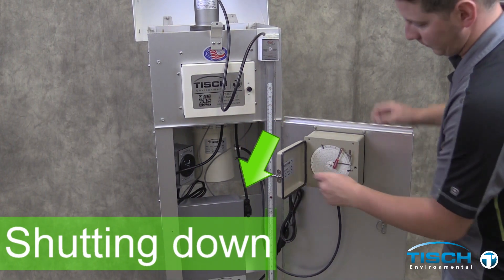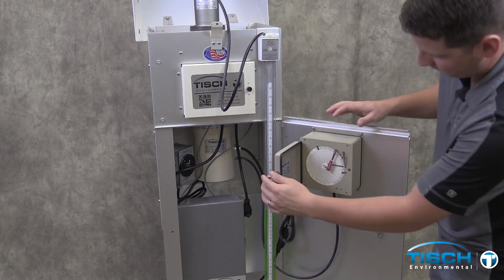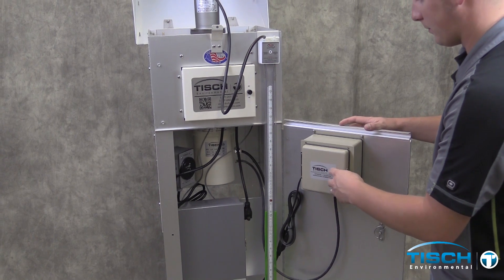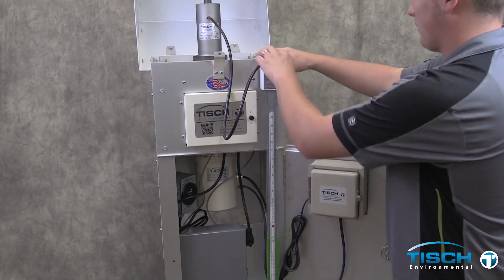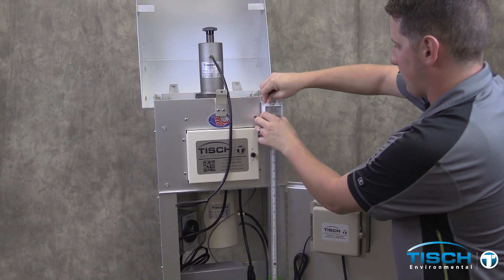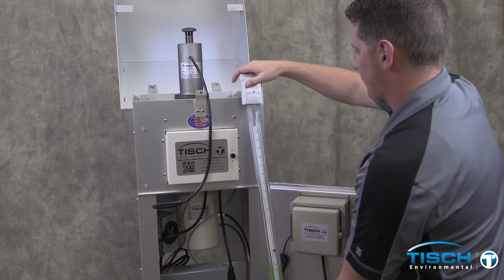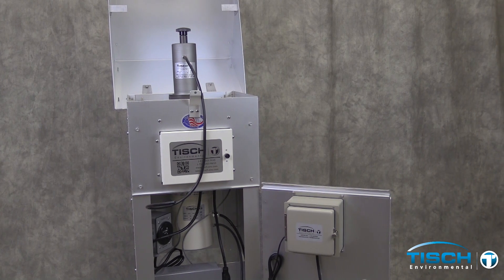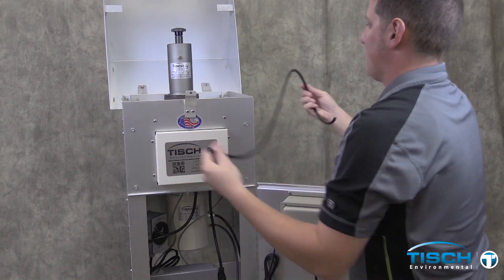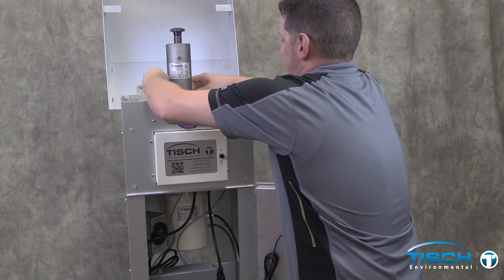Unplug the motor and re-plug it into the mass flow controller. Put the pen cap back on. Close the recorder door. Remove the tubing from the manometer. Close both valves on the manometer. Remove the manometer. Remove the tubing.